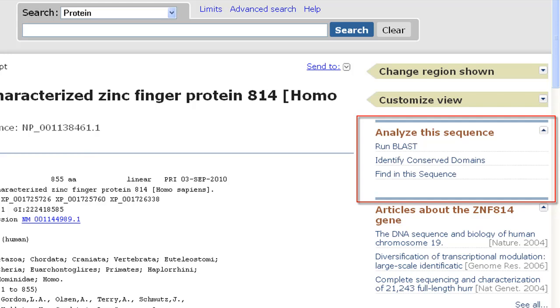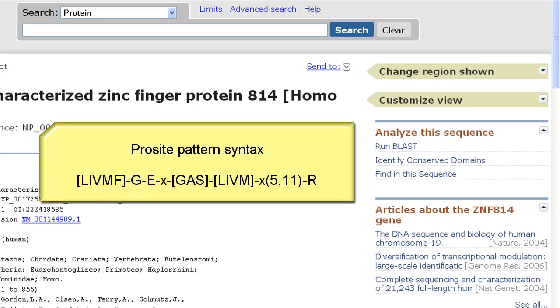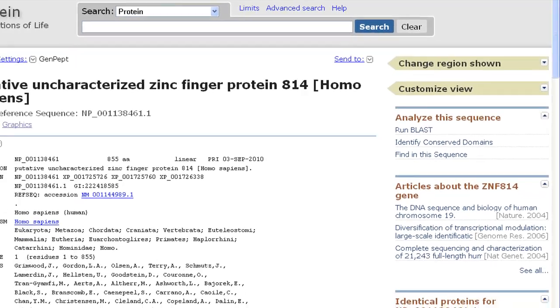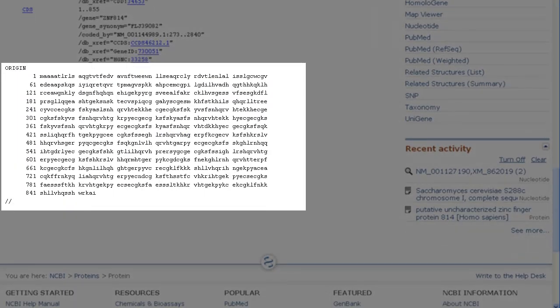Your first question might be: how is this better than my browser's find function? First of all, it takes patterns as input, like the PROSITE pattern syntax and IUPAC ambiguity codes for nucleotides. And second, it ignores white space and breaks between lines, essentially wrapping around the displayed sequence.